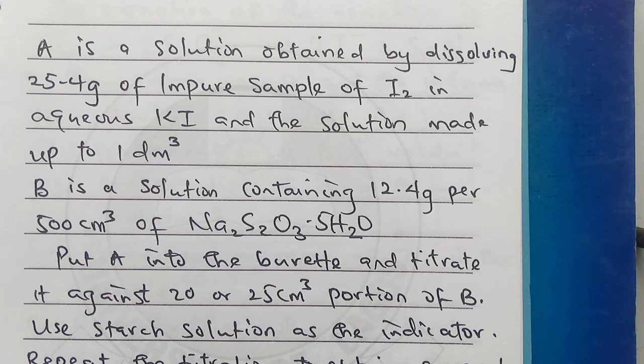A is a solution obtained by dissolving 25.4 grams of impure sample of iodine in aqueous potassium iodide, and the solution made up to 1 dm³. B is a solution containing 12.4 grams per 500 cm³ of sodium thiosulfate pentahydrate. Put A into the burette and titrate it against 20 or 25 cm³ portion of B.